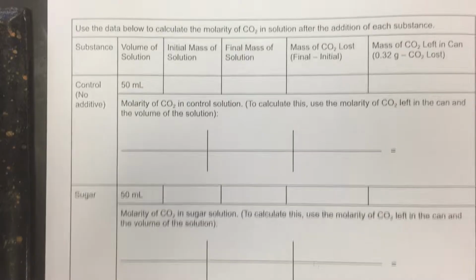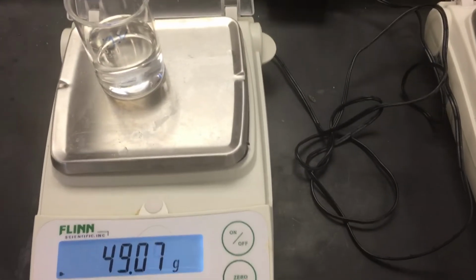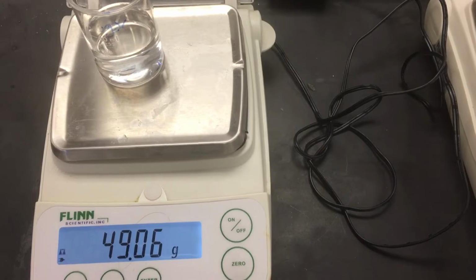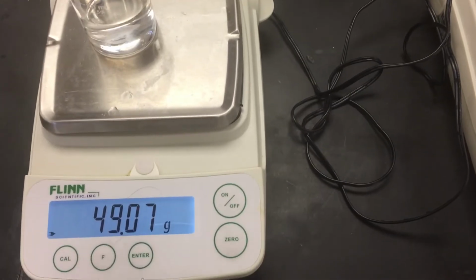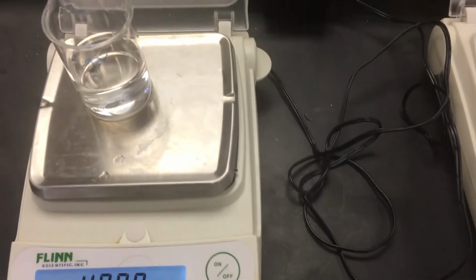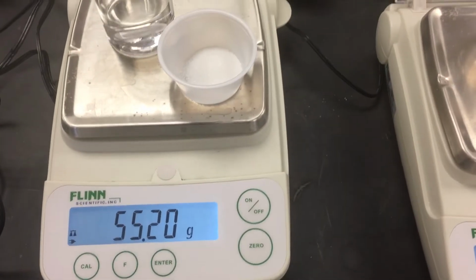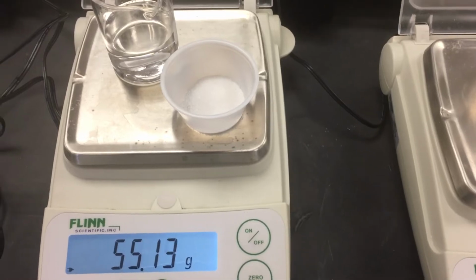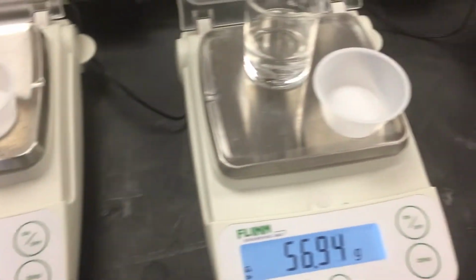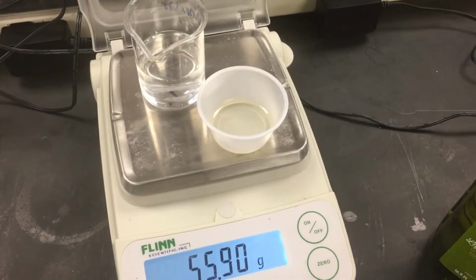Okay, so what I have set up is, here, let me just bring you over here. So I've got beakers with Sprite in them. They all have 50 milliliters of Sprite, and the mass is fluctuating a little bit because it's really windy in here. But we have Sprite. This balance is measuring Sprite and sugar. Just the Sprite and the sugar. It's zeroed, so it's not measuring the cups or the beaker. This one is Sprite and salt. And this one is Sprite and oil.